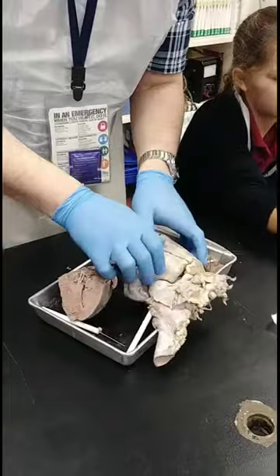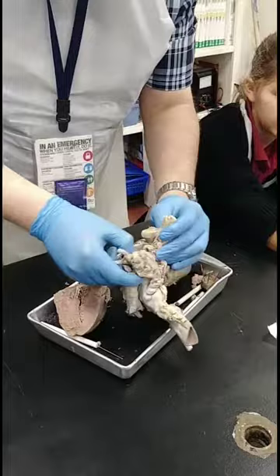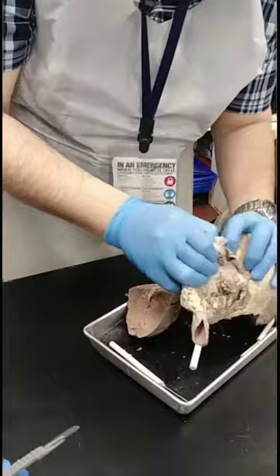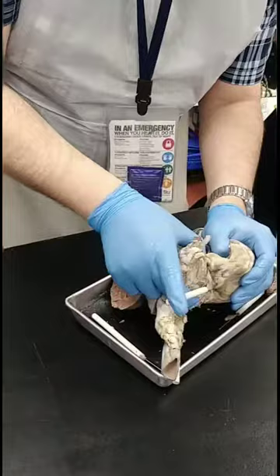On this, the right side of the heart, that's all the right ventricle. That goes up into the right atrium, which is going up to here. And let's find the vena cavae, which is very thin. Remember, veins are thinner than arteries, right? Okay. It's a little bit collapsed. That's this business here. I'll use a probe. You see this? That vein? How thin it is? That goes to the right atrium. See where the probe's going? See that?